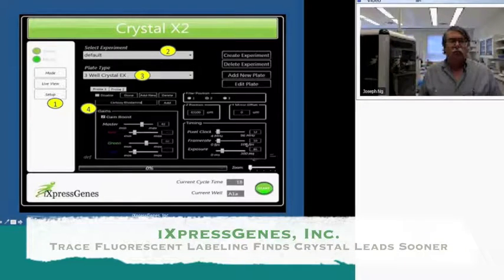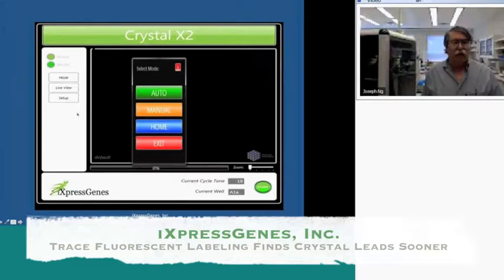Down here, in this section, we can edit these parameters for each different white light or light color source. And what we're adjusting down here are the camera parameters for the exposure time, the rate at which the frames are taken, the gains for the different colors of the camera and the master gain, plus the Z position, since different light colors are going to offset or focus at different points, and we can adjust for that here as well.